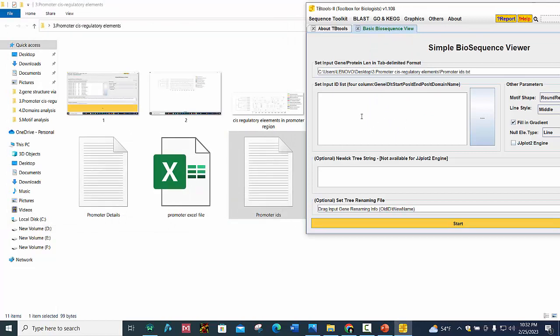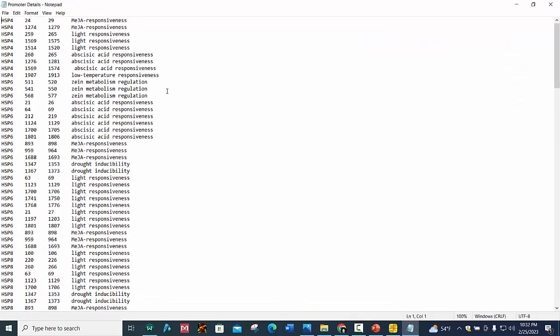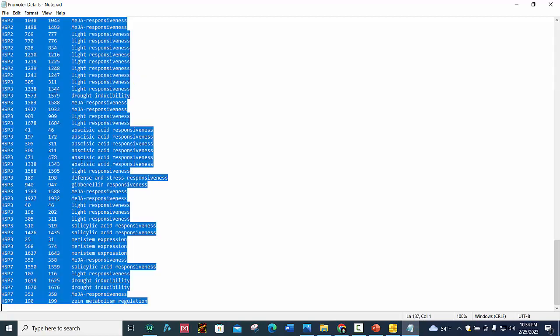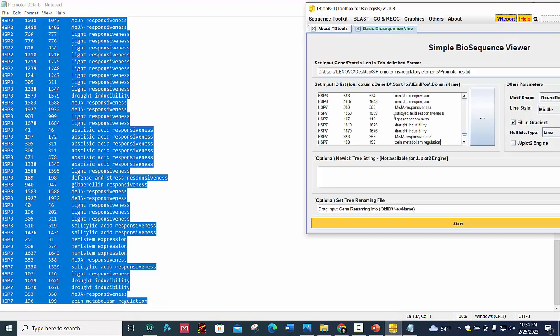And second is set input ID list where we place promoter details. I make this file from PlantCARE website. I will make a separate video on how to use PlantCARE website to get cis-regulatory elements in promoter region. So we select all and copy this and place it here in set input ID list.